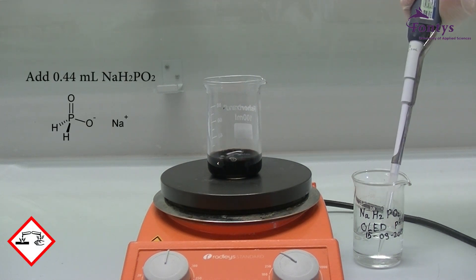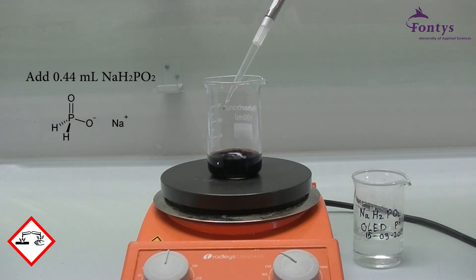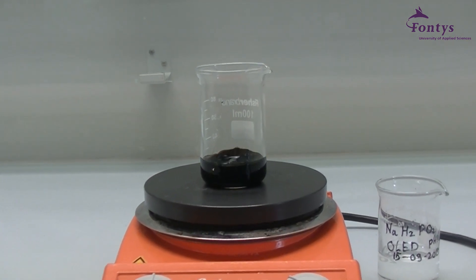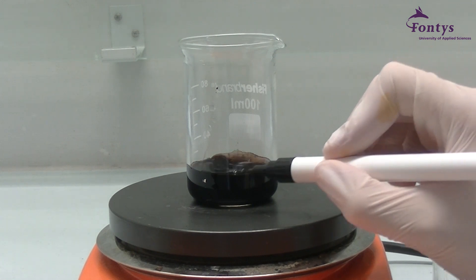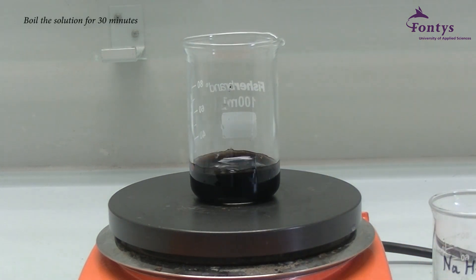Finally, add 0.44 milliliters of sodium hypophosphite using a pipette. Next we are going to turn up the heater. Mark the water level and keep the volume at that level by adding water. The solution will now be boiled for 30 minutes.